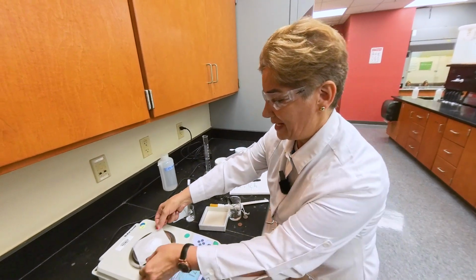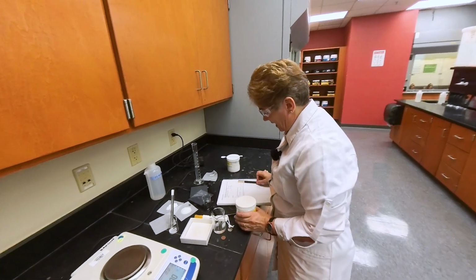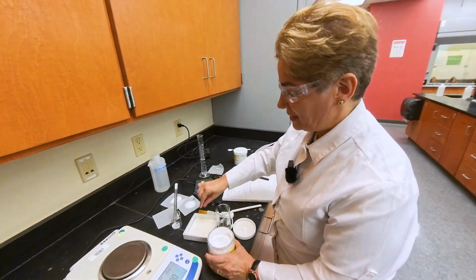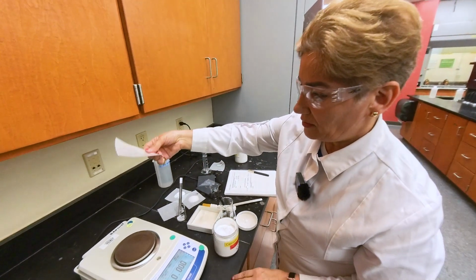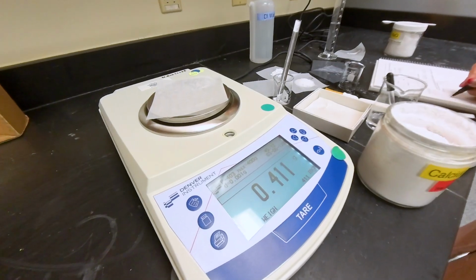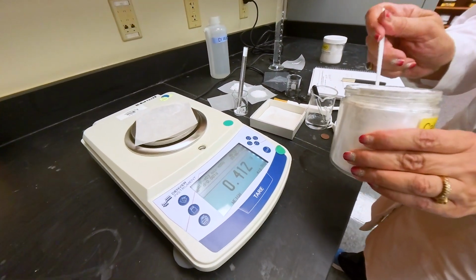Next, which is the last part of this experiment, measuring mass of the calcium chloride, that is going to sit for 15 minutes. So what we are going to do here, we take 1 spoon of the calcium chloride. We are going to measure the mass. So measure the mass of the weighing paper. Then add 1 scoop of the calcium chloride.